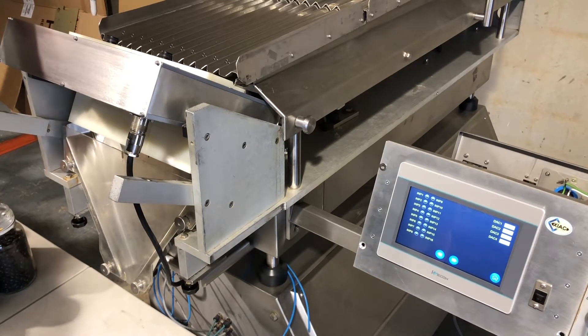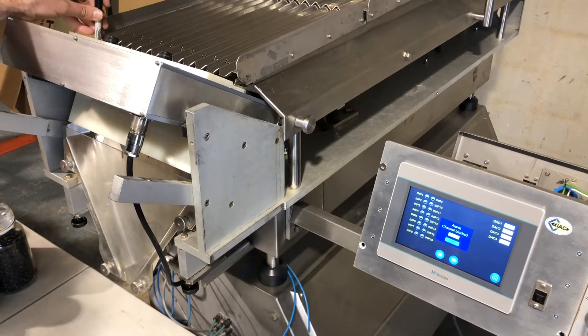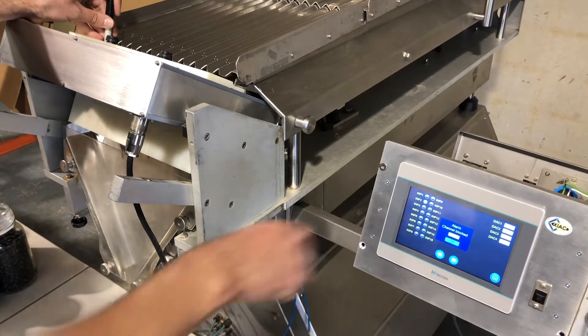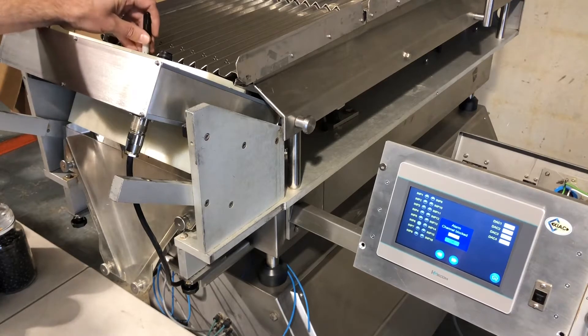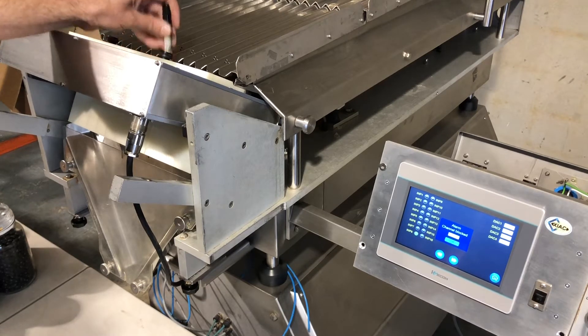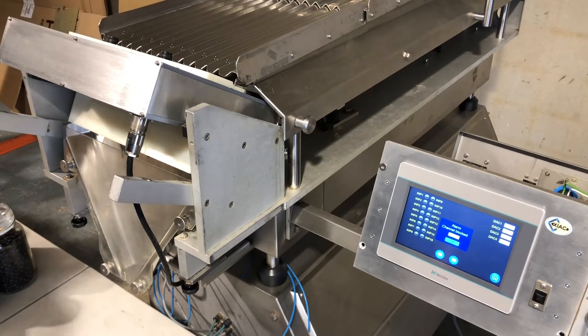So if I put a pen, channel 1 turns green. It also gives an alarm because the channel is blocked. Don't worry about that. Channel 2, channel 3, 4, 5, 6, 7, 8, 9, 10, 11 and 12.